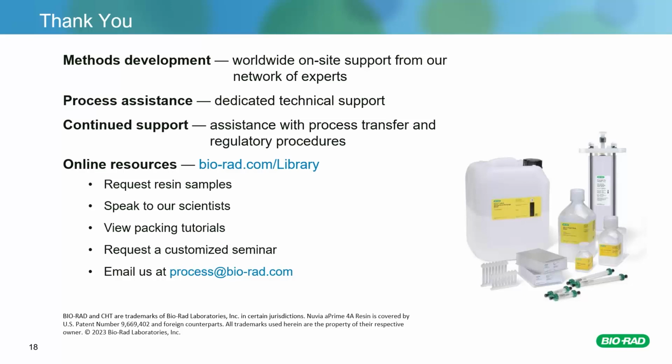What are the typical factors to be tested for Nuvia A Prime 4A and CHT?